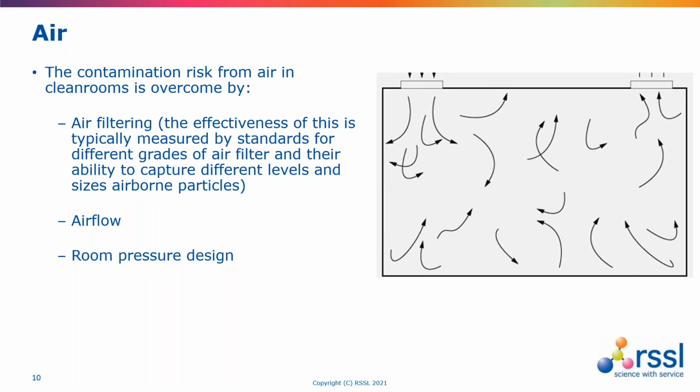things like sealants. We would need to put in there, quite importantly but sometimes overlooked, things like torque settings. So that is the way that the HEPA filter is secured within the filter housing. And we also need to consider things like airflow and room pressure design.